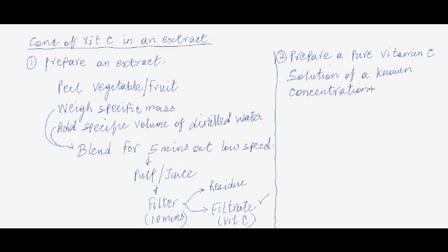Now, how do we do this? What we need to do is, first of all, using a sensitive weighing balance, you accurately weigh a specific mass of vitamin C. Let's say we take 10 milligrams.